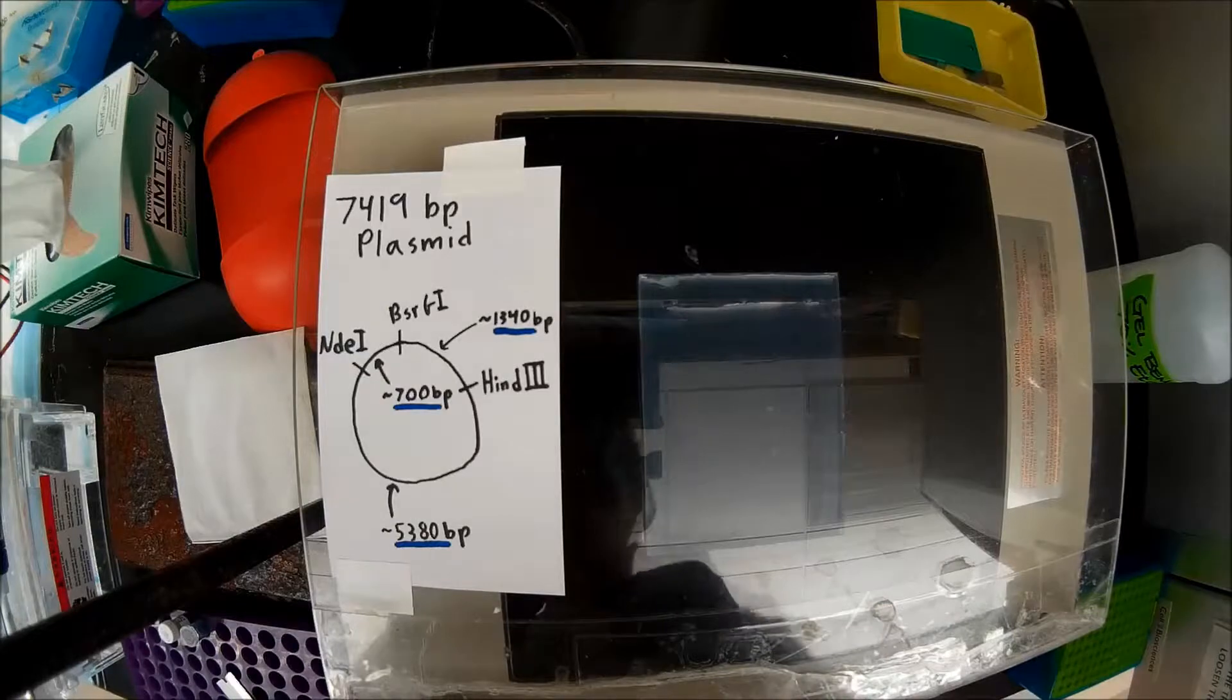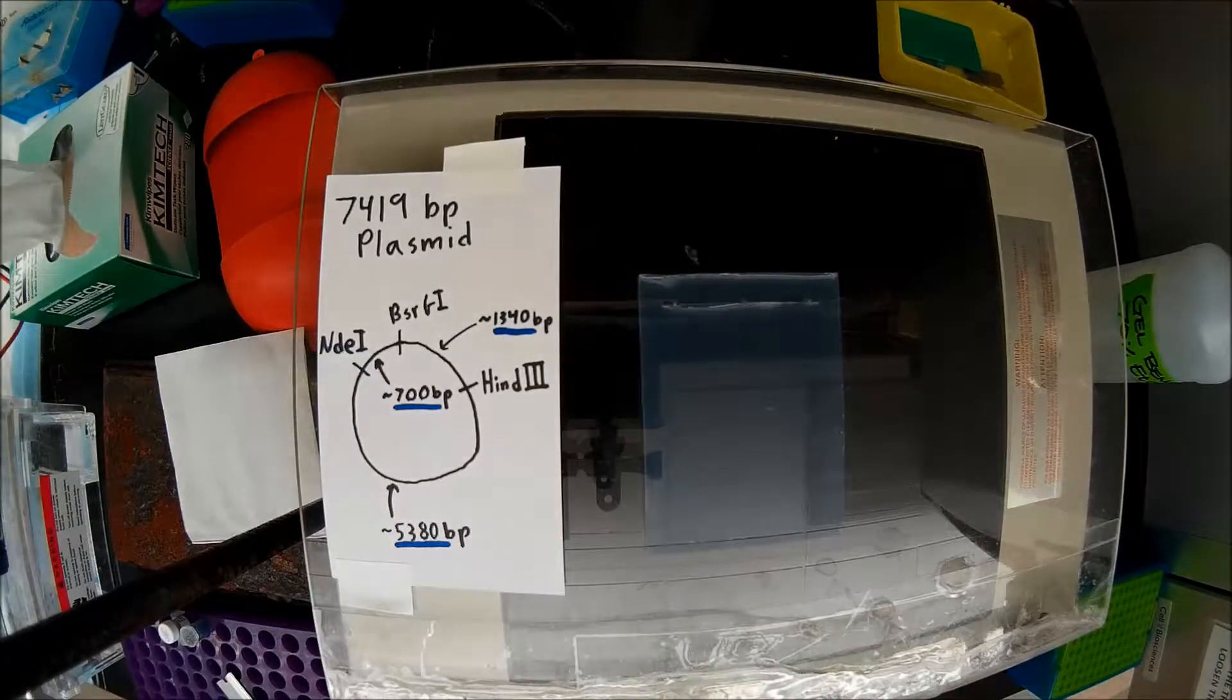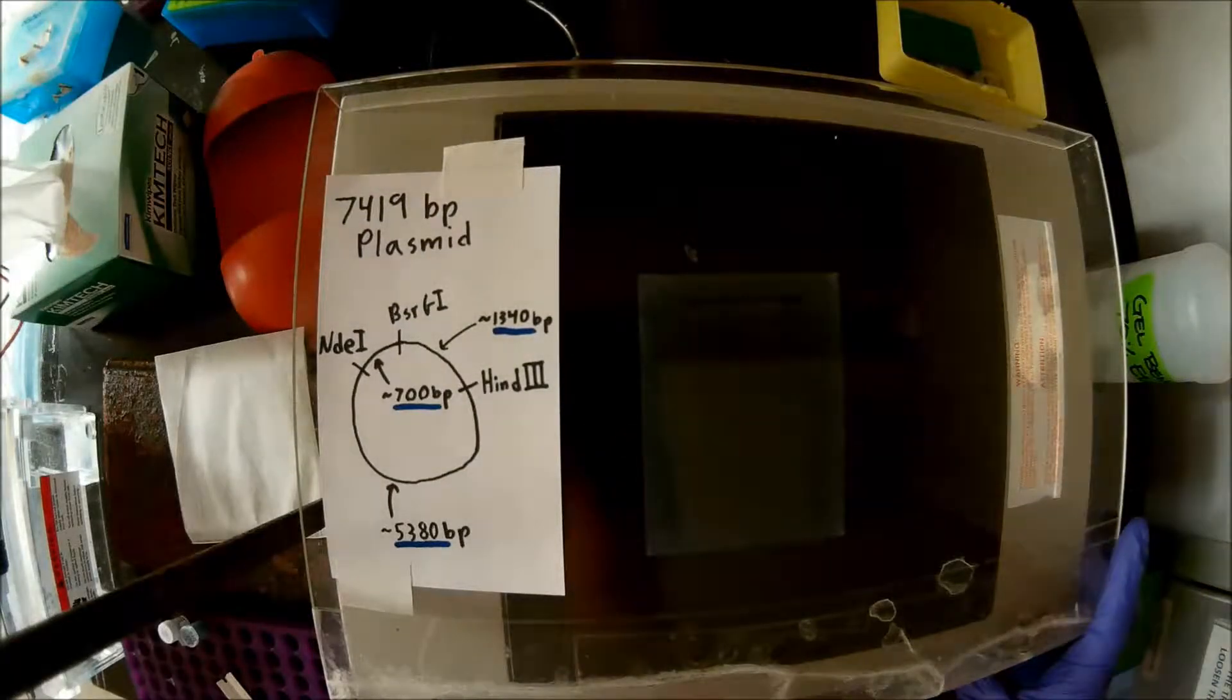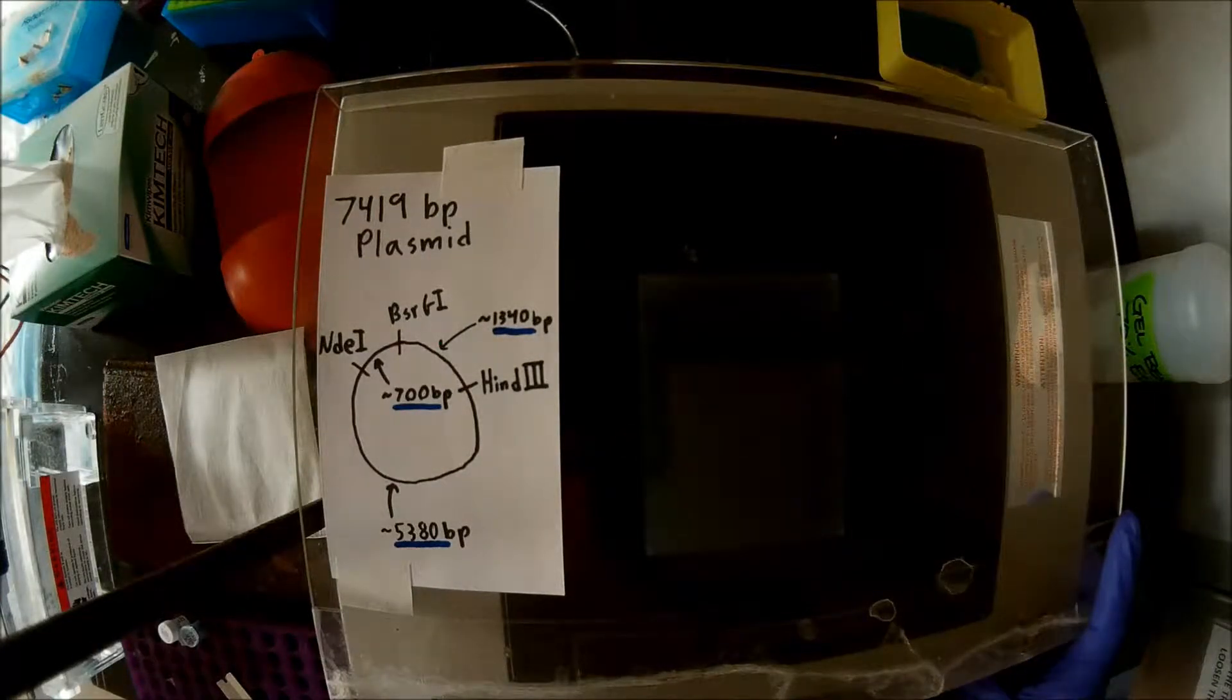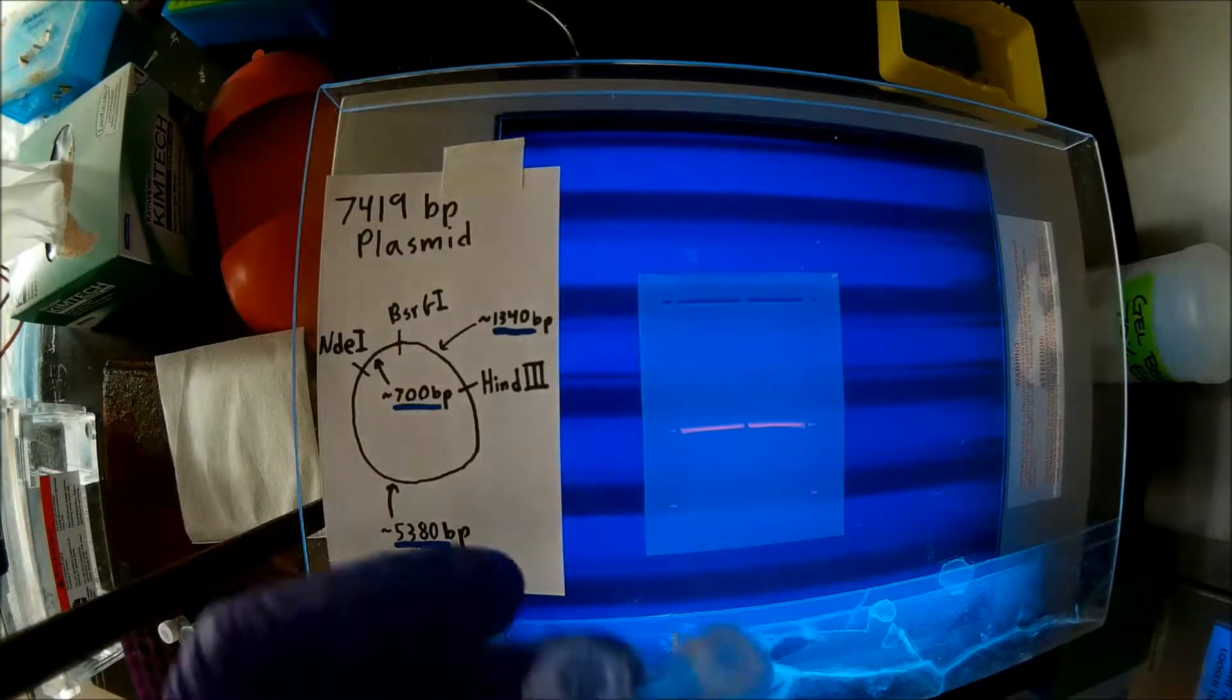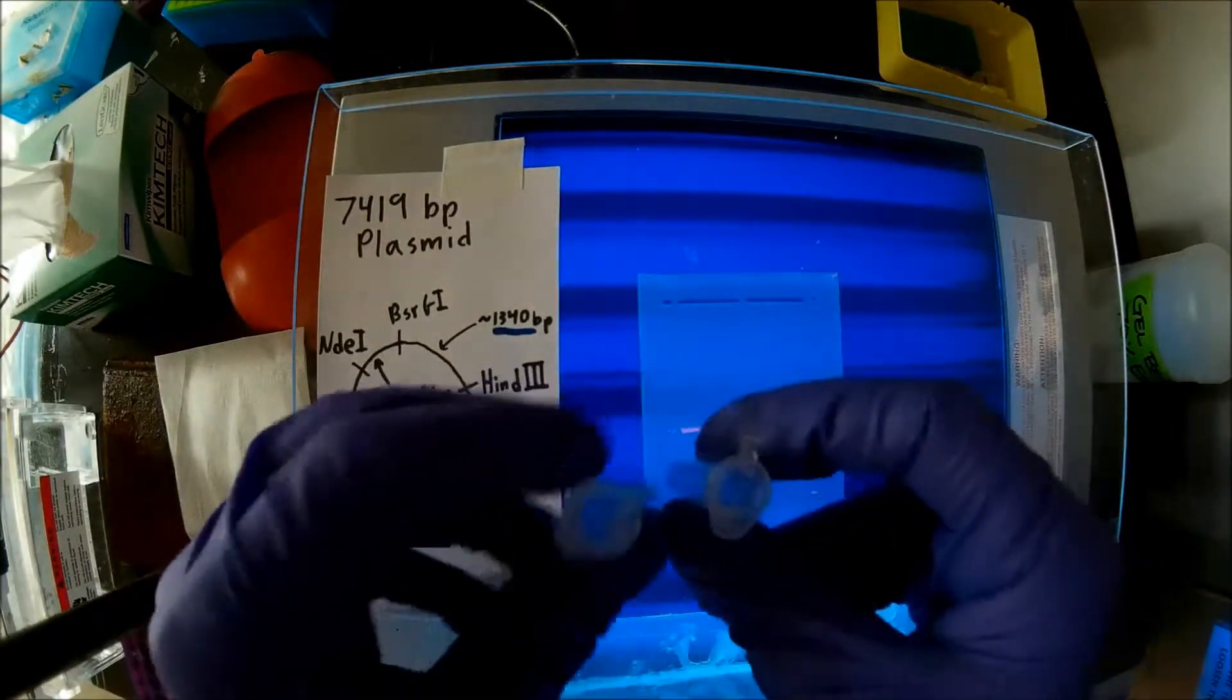I'm going to go turn off the lights really quickly so that we can see these bands a little bit better. And when we turn the transilluminator back on, we can see those bands again. Now, I've prepared two 2mm centrifuge tubes here for my samples, and I've already labeled them.